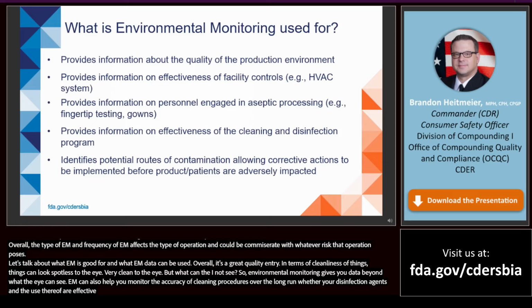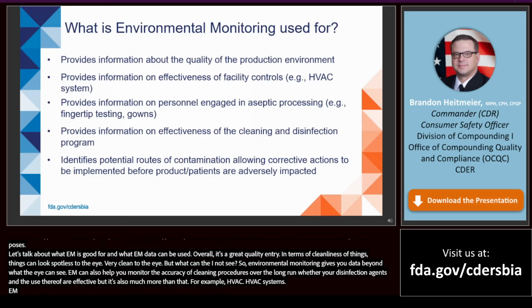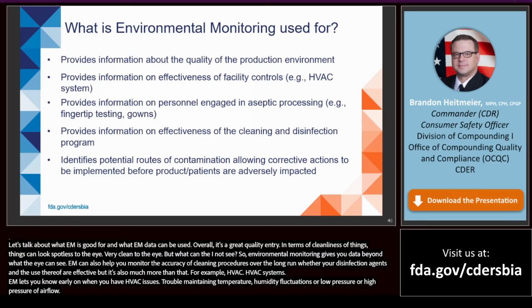For example, HVAC systems. So EM lets you know early on when you have HVAC issues, trouble maintaining temperature, humidity fluctuations, or low pressure or high pressure of airflow would be a clue if you were doing that type of EM monitoring.